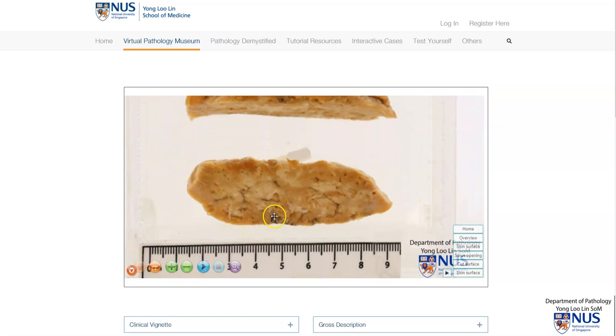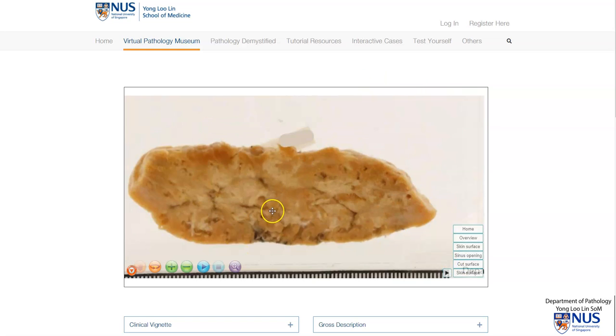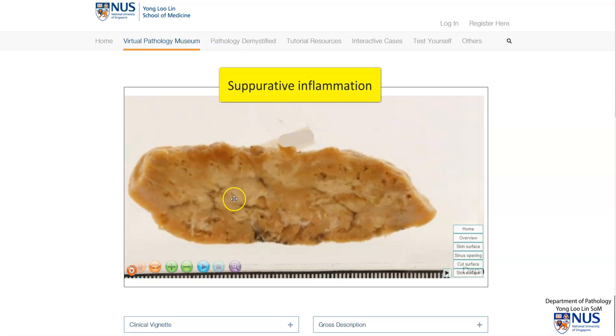Here on the cut surface, these yellowish areas represent suppurative inflammation, and we also have some abscess cavity formation.